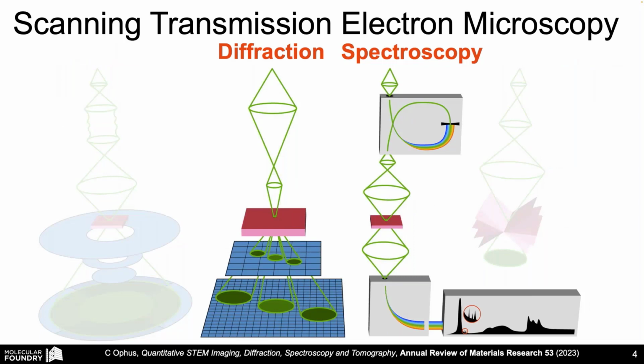I'm not going to show any super fancy spectroscopic results. Mostly what I'm going to be focused on is diffraction experiments where we place our camera behind the spectrometer so that we can do energy filtered diffraction experiments.